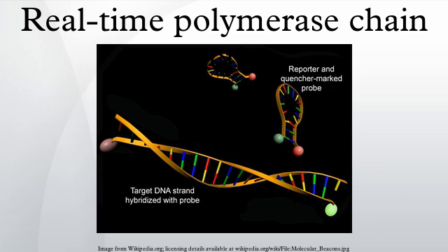Discrimination between the DNA of the pathogen and the plant is based on the amplification of ITS sequences, spaces located in the ribosomal RNA gene near the coding area, which are characteristic for each taxon. Field-based versions of this technique have also been developed for identifying the same pathogen.